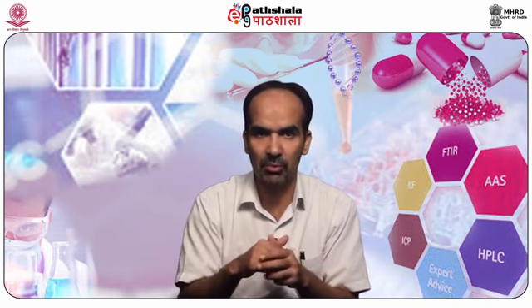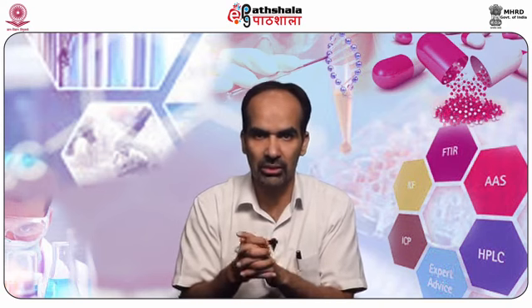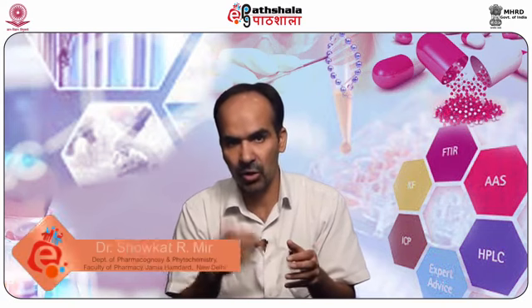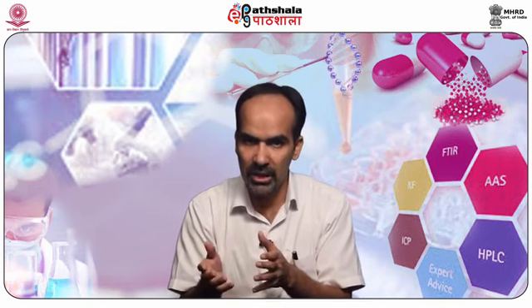A number of quantitative tests are used which are based on their physical properties and chemical properties to evaluate the volatile oils and their constituents such as alcohols, aldehydes, ketones, esters, phenols, etc. Certain physical constants of volatile oils are also significant with respect to ascertaining their quality. So some of those are specific gravity, solubility in alcohol, dilute alcohols, refractive index and optical rotation. These tests and parameters provide a detailed insight of the quality as well as the chemical composition of these substances.